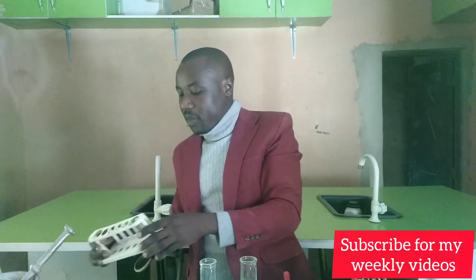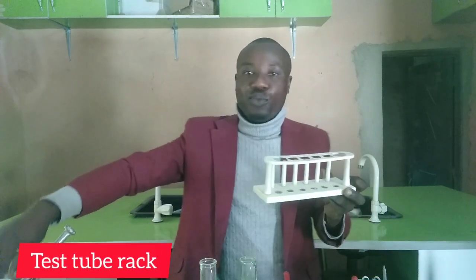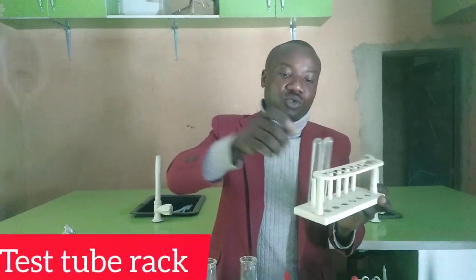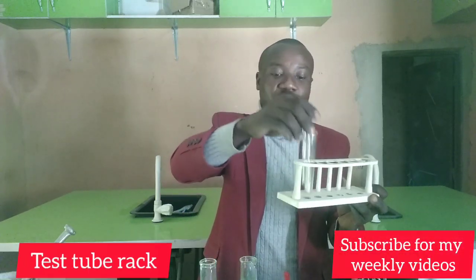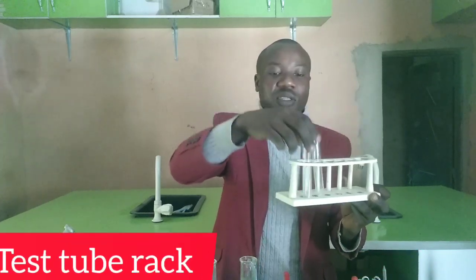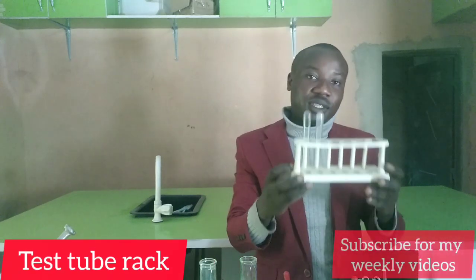Now let me also show you another thing which we call a test tube rack. I can put my test tube on it like this. Maybe after an experiment, you wash it and place it on the rack. It depends on the size; the bigger one I can put here like this. This is what we call a test tube rack.